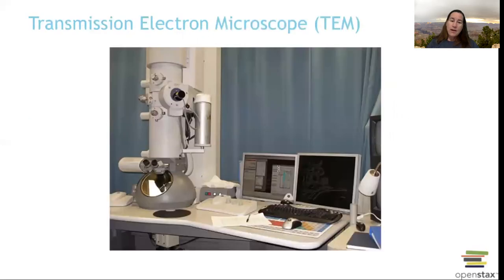So that's two photon. And then we have the electron microscopes. Electrons can be transmission either way. If you see EM at the end, they're using electrons. Electrons are going to be short wavelength, high energies. We said earlier that short wavelengths are going to increase resolution, and we're going to have a better magnification too. So with electron microscopes, if you see a great image and you see TEM for transmission or you see SEM for scanning electron microscopes, they are using electrons and they are either bouncing it off the surface or they are transmitting it through the object.